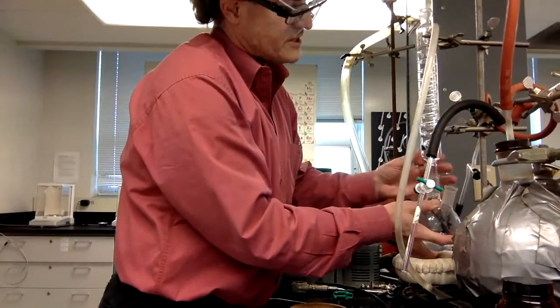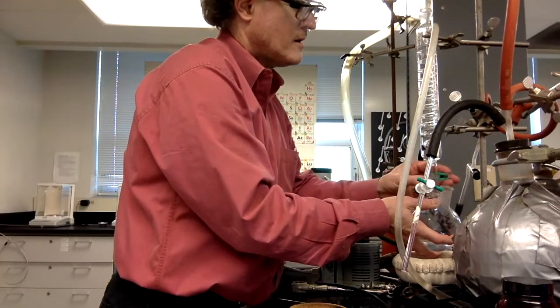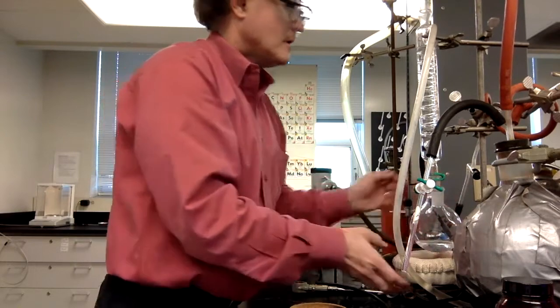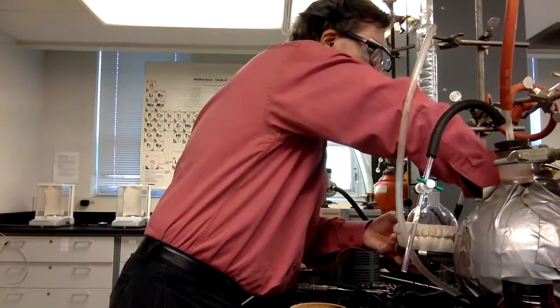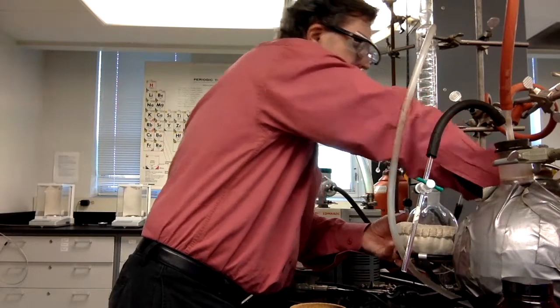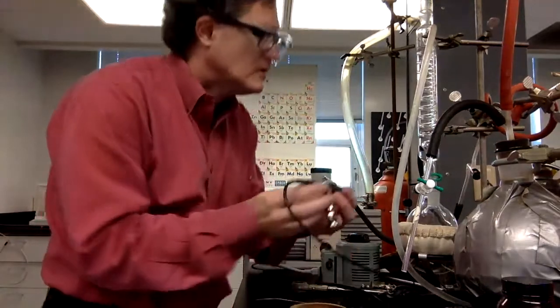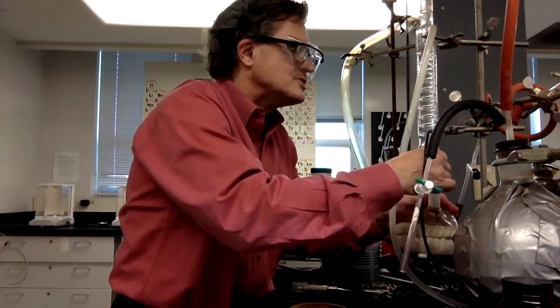Wedge it in, just a little bit of vacuum grease, thin film of vacuum grease up there. All right. We're going to cinch this back up to make good thermal contact with the heating coil. Our temperature probe, the thermistor, we've got to stick in here. Now, we jam that in there, we get a good seal, and then there's something very important.